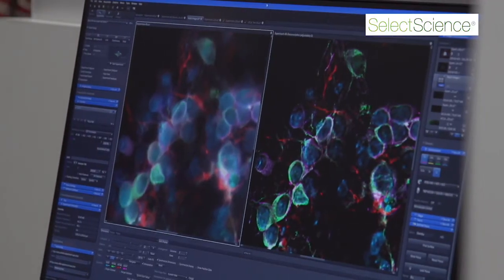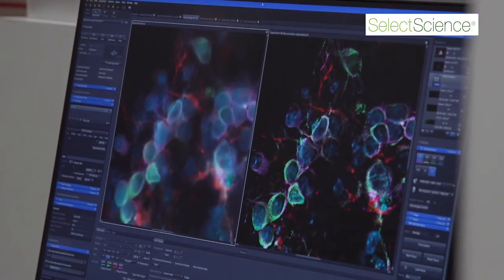The main features of the Cell Discoverer 7 are the optical concept, which are excellent, and the automation, which protects your objective from crashing into anything you might be placing inside. It also has LEDs which allow very gentle imaging.